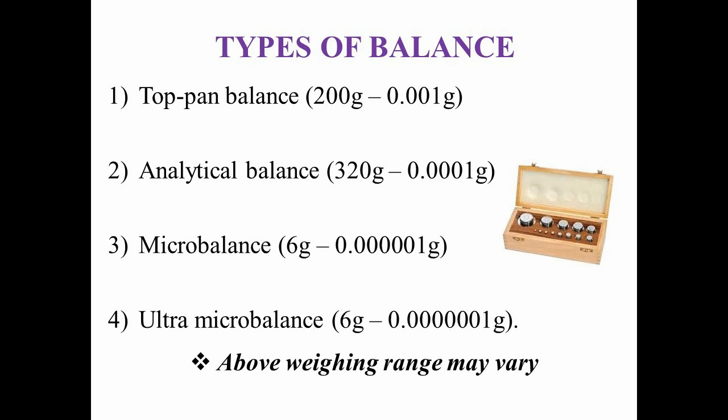4 types of balance are available. 1. Top pan balance. 2. Analytical balance. 3. Microbalance. 4. Ultramicrobalance.